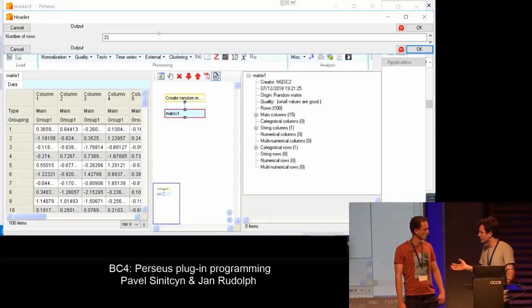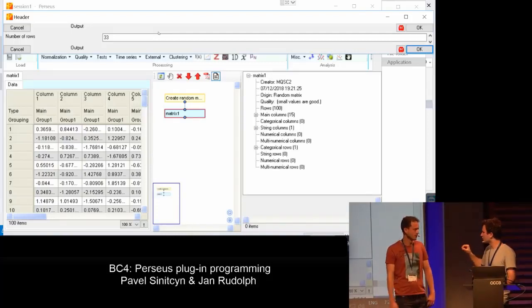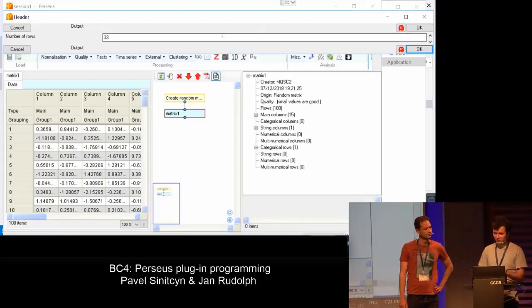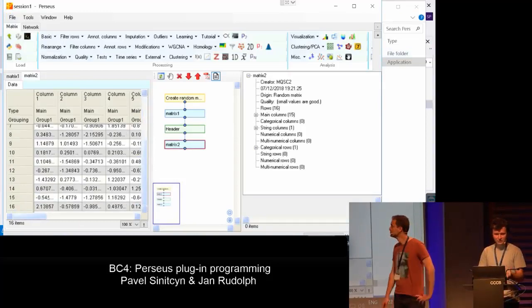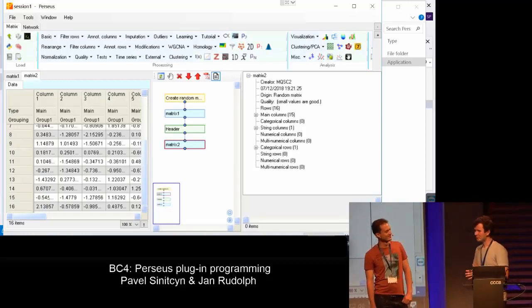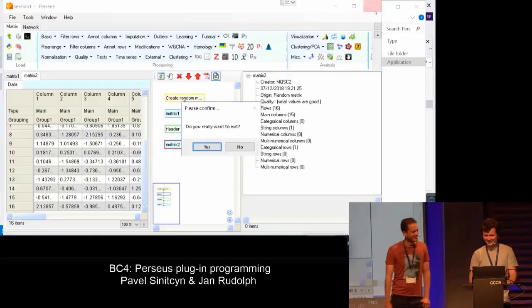We can actually specify whatever. Before it was specifying data row count. It basically means how many rows exist in the matrix which you want to change. So now you see it's specified 33, and let's leave it how it is. And what are we going to receive? Instead of 33, we are going to receive 16. So I think we made a mistake. Let's not call this a mistake. Let's call this work in progress.